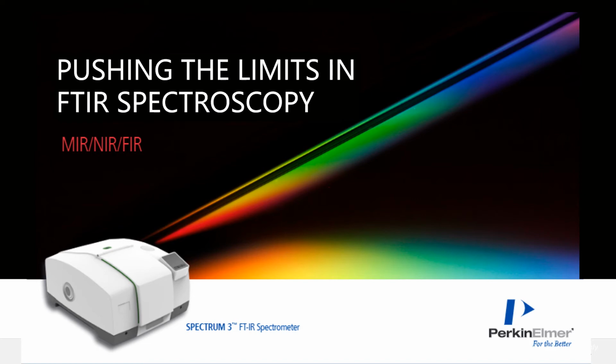All right, thanks, John. In the first section of FTIR, we will very briefly discuss navigating the instrument landscape with a focus on the Spectrum 3 FTIR from PerkinElmer. Next, we will discuss the Spectrum 3 Optica and how to verify its performance for measuring samples that require extremely high ordinate accuracy.